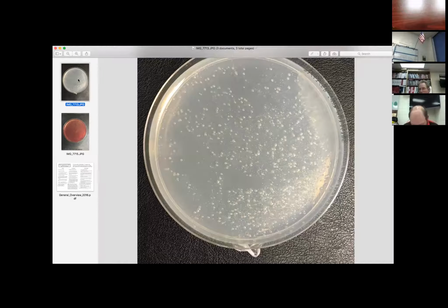So you are going to need to help them figure out some type of system so they know which colonies that they've counted. Maybe if they think of the Petri dish in 4 quadrants to start, but they're going to have to be very careful where they hold it because if they turn it, it's not going to make sense. But they're not allowed to write on the Petri dishes. And you don't want your students to count half of the bacteria twice because they're going to have an inaccurate count number. So let's look at actual Petri dishes on the document cam that are at 48 hours.